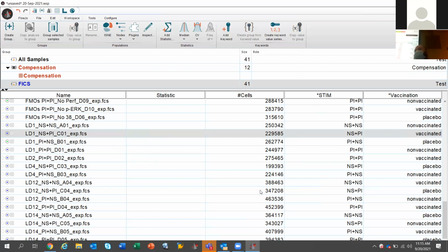You could do that analysis now. You don't just have to ask for phenotypes. Or if you want to ask, how do I compare between my 3 different days, day 0, 1, and 2, and do an additional analysis of vaccinated and non-vaccinated per se. You could do those 2 non-conventional comparisons and incorporate them into your high dimensional analysis.